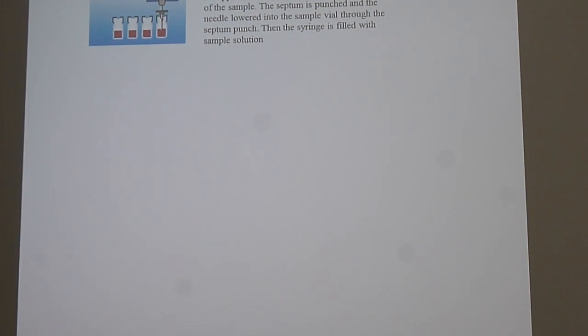What I think is very helpful for free mode is if you have a horizontal chamber and from both sides you want to start application. In the normal case, you have to apply one plate, and you have to turn the plate to the other side. In free mode you can spray one side and then the other side in one go, and then you can directly apply. That's much better.